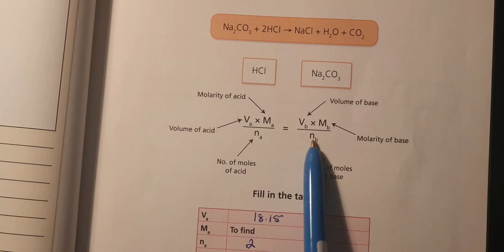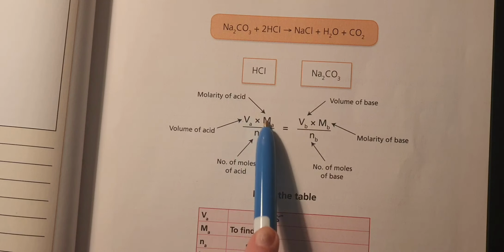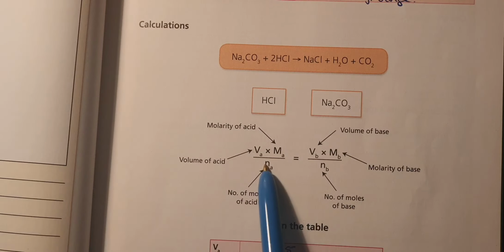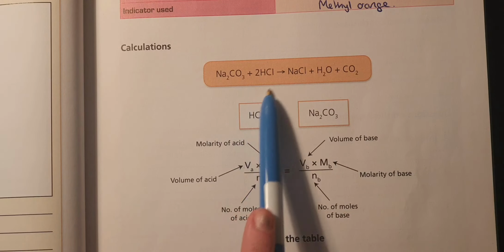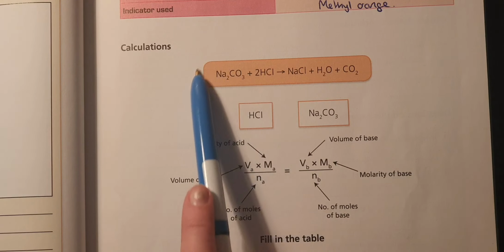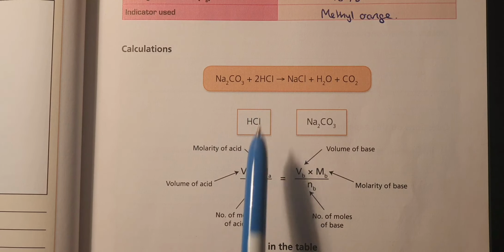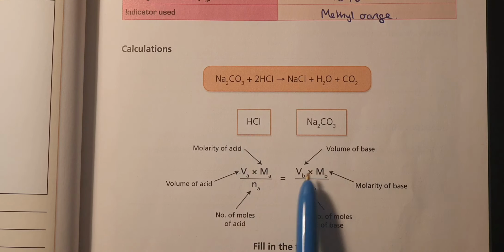VA-MA-NA, VB-MB-NB. So VA stands for the volume of the acid, molarity of the acid, and the number of moles of acid. You get that number of moles from the chemical equation up here. So see how there's a big 2 there? That means 2 moles of HCl would react with 1 mole of sodium carbonate in that ratio, 1:2. So Na is going to be 2.